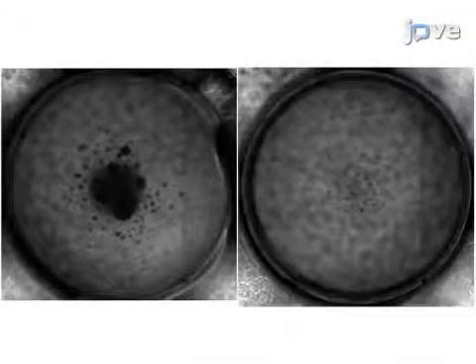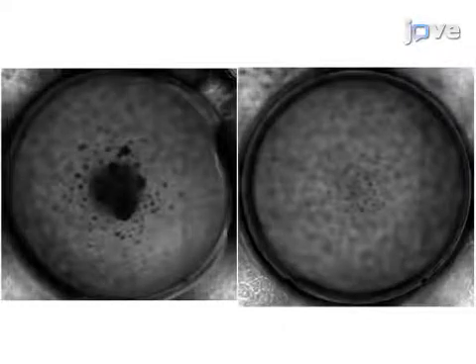After 5 weeks of EBV immortalization and CpG 2006 stimuli, immortalized clones were isolated. WI38 feeder cells have a more elongated fibroblast shape, and the B cell clones appear as very small round cells growing clustered in the middle of the round bottom multi-well plate.